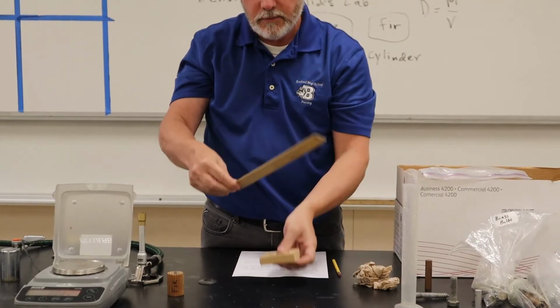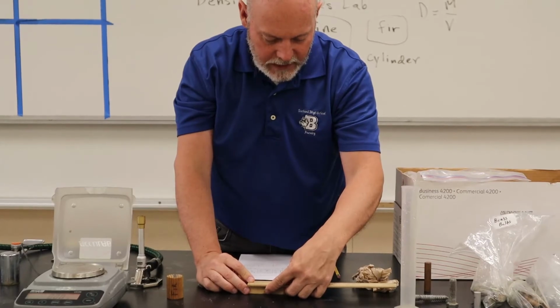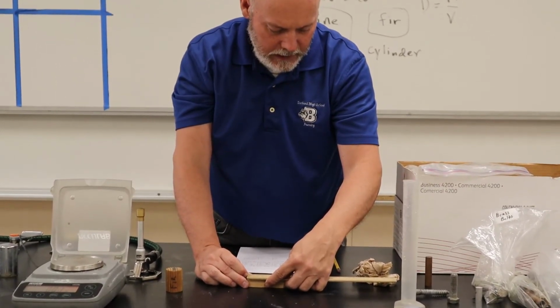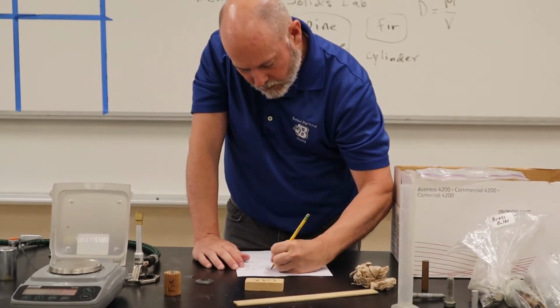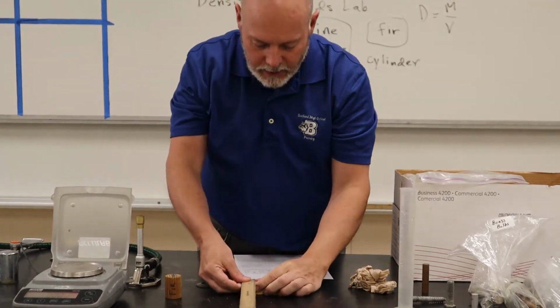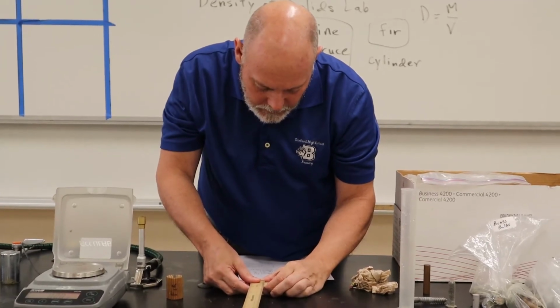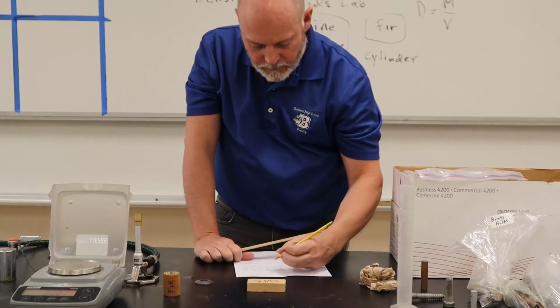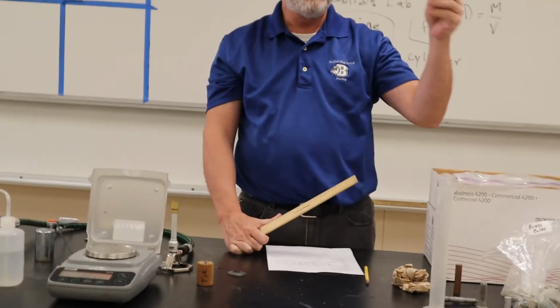And then over is 77 millimeters. And then out is 34 millimeters, or 3.4 centimeters.